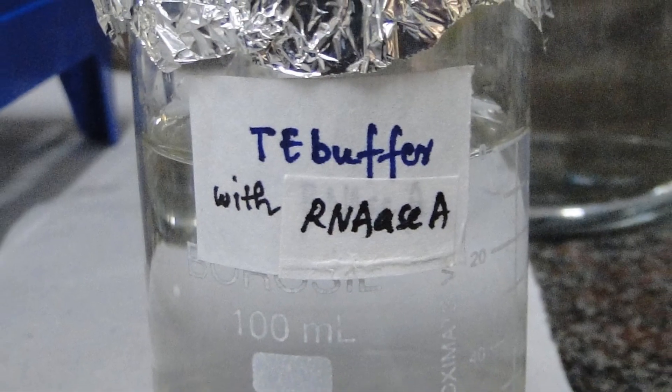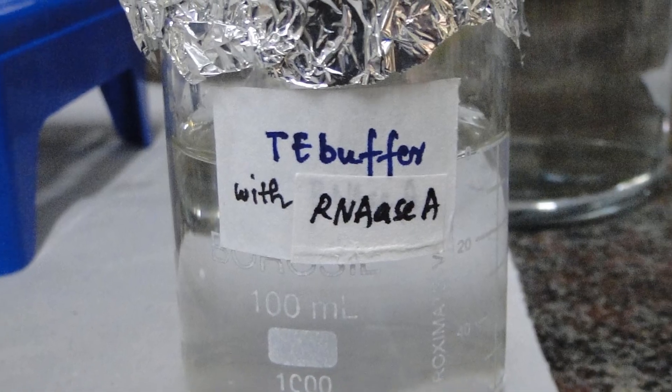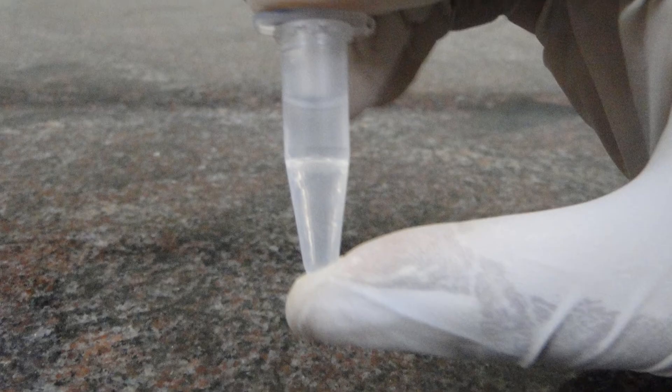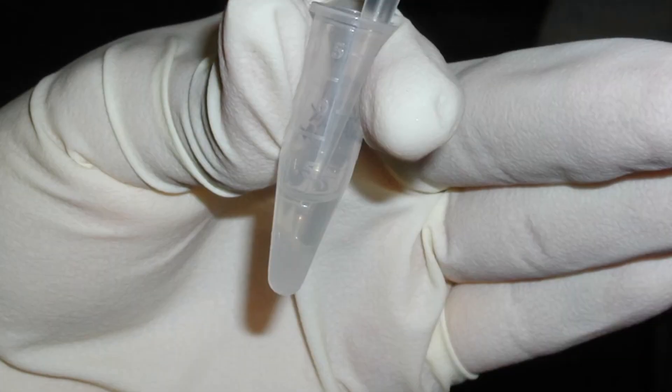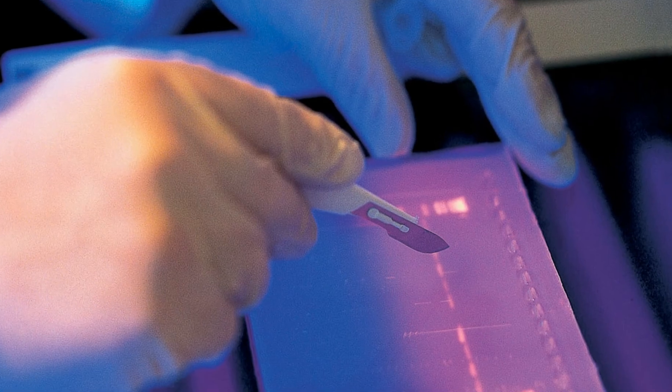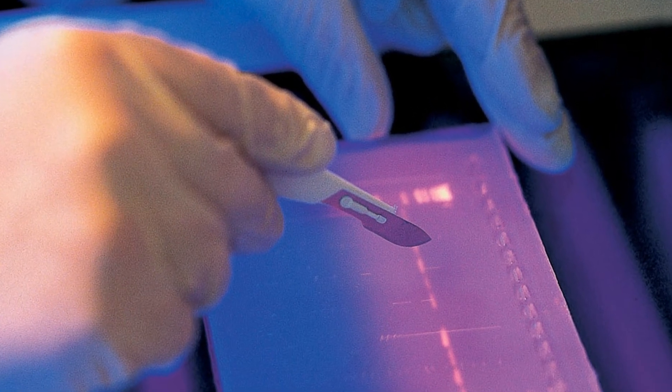Take 50 microlitre of the reagent TE buffer with RNase A to remove the RNA contamination in the plasmid. Transfer the reagent to the dried vial. Vortex the vial and load it into the agarose gel with a suitable marker to observe the DNA.